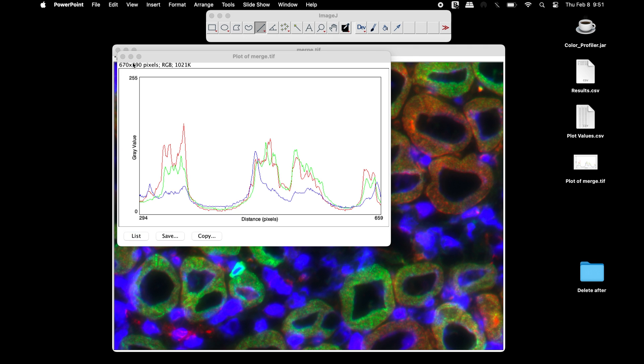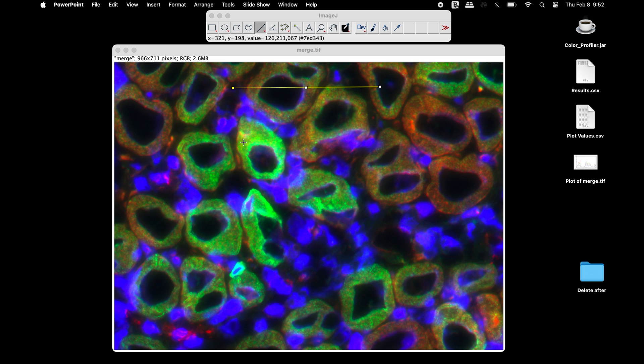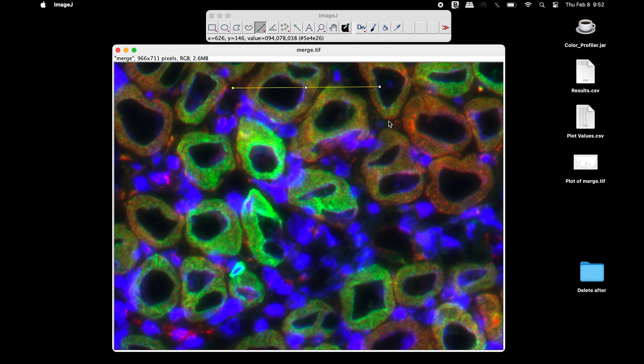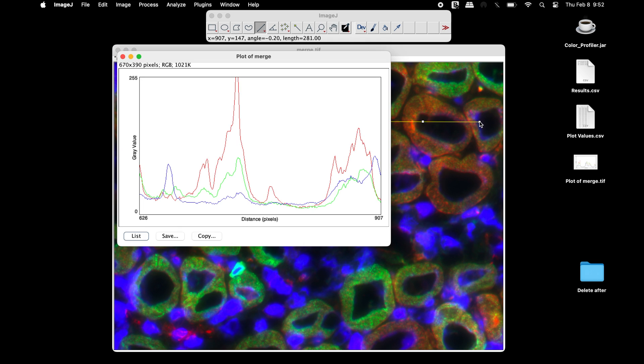To generate another plot profile in the same image, use the line tool and mark the region of interest. Once the line is drawn in the image, the plot profile will be generated.